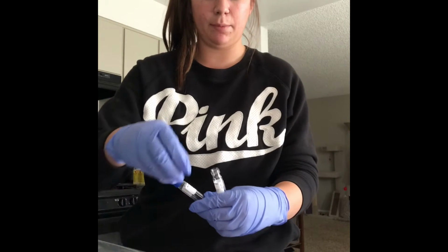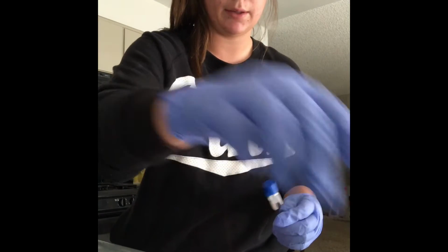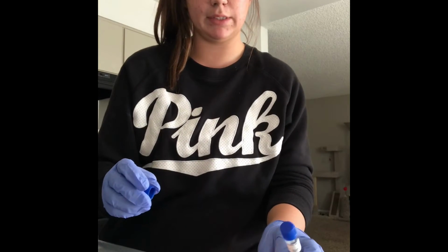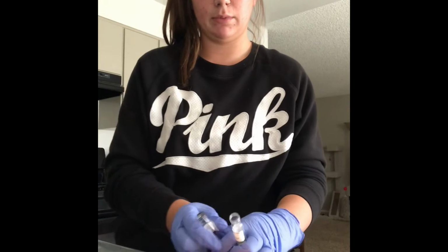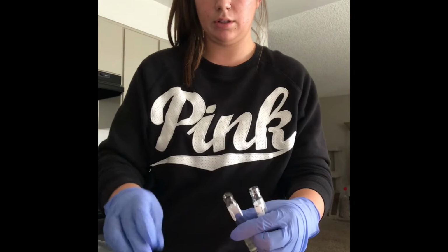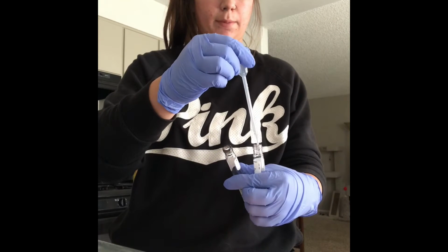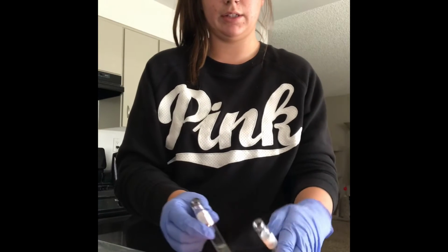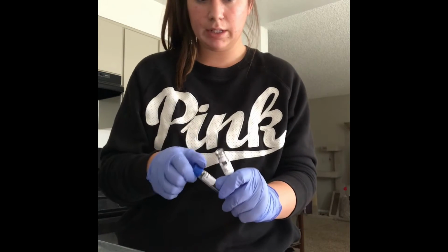I'm going to set my S-epi pH of 5 aside so I can continue with my other ones. So that's S-epi. So now I have my S-epi pH of 7. I'm going to just repeat the same steps for these ones. Sterilize, and I'm going to sterilize this one. And place 2 drops of S-epi. 1, 2. Sterilize and sterilize. Now I'm going to place this one aside.